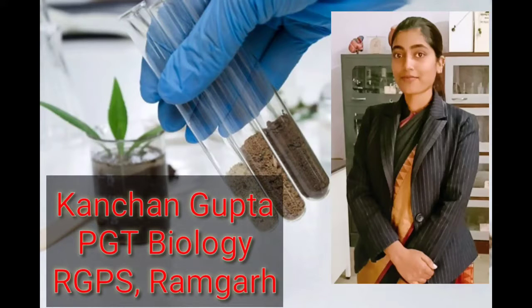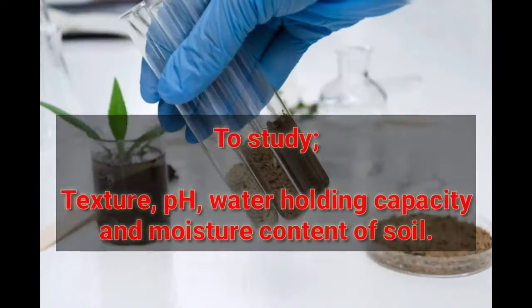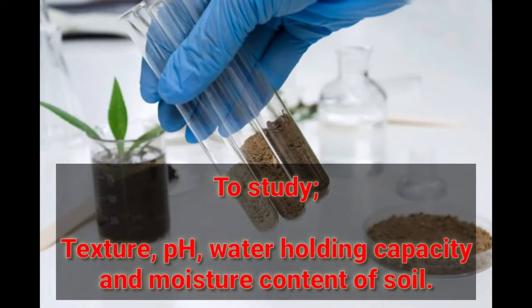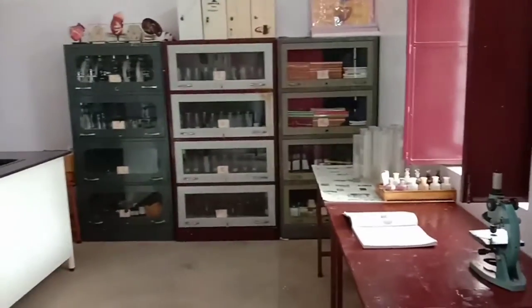Hello everyone. Today we are here to study texture, pH, water holding capacity and moisture content of the soil. We are here in our bio laboratory of Radha Govind Senior Secondary Public School, Ramgarh Cant. So let's see what experiments we have to do.